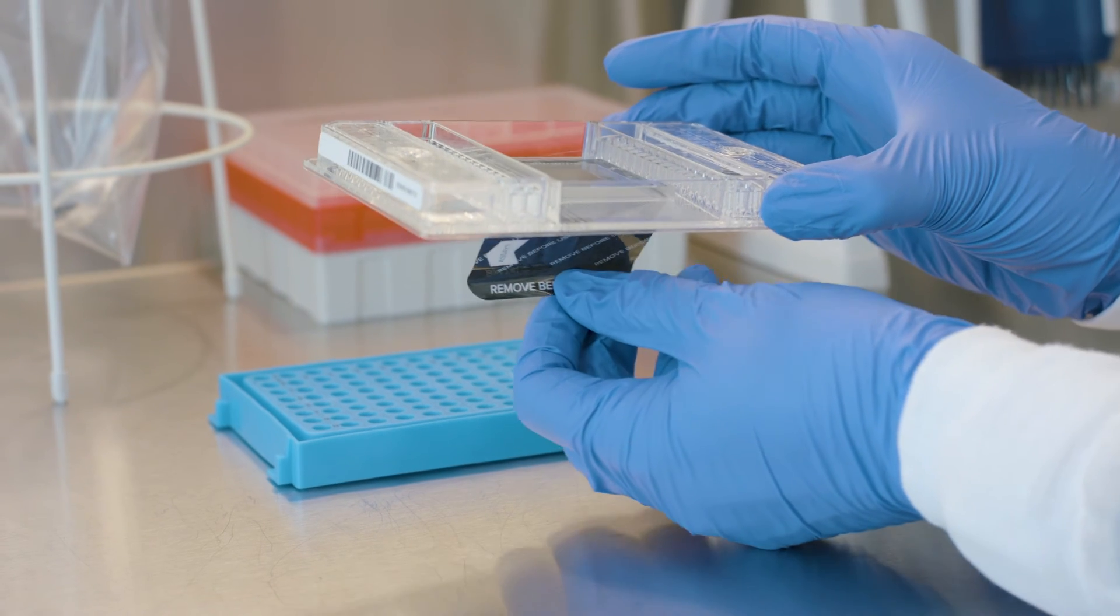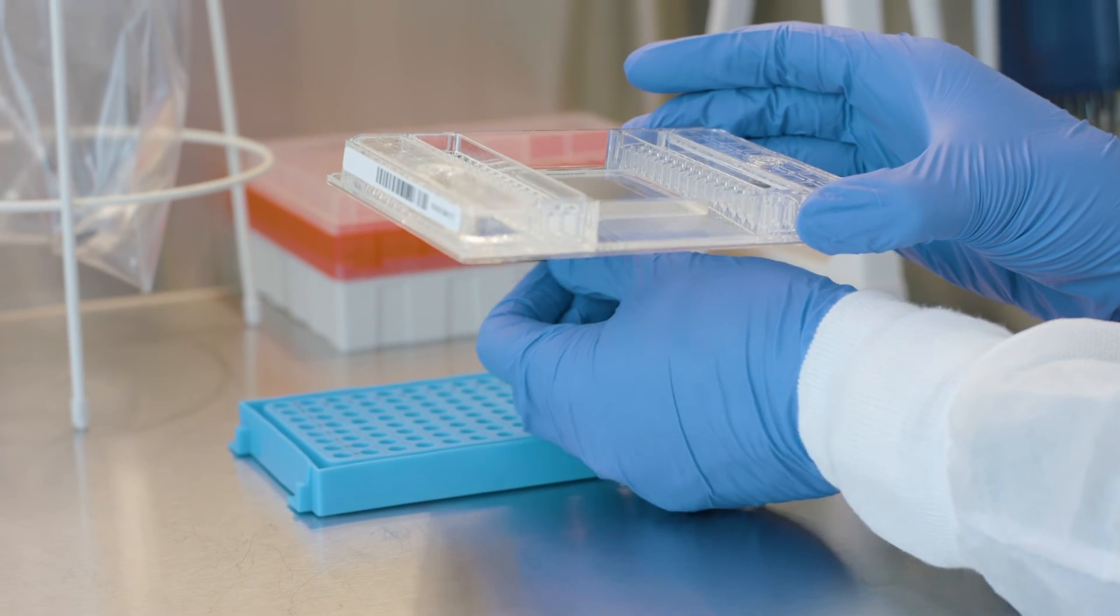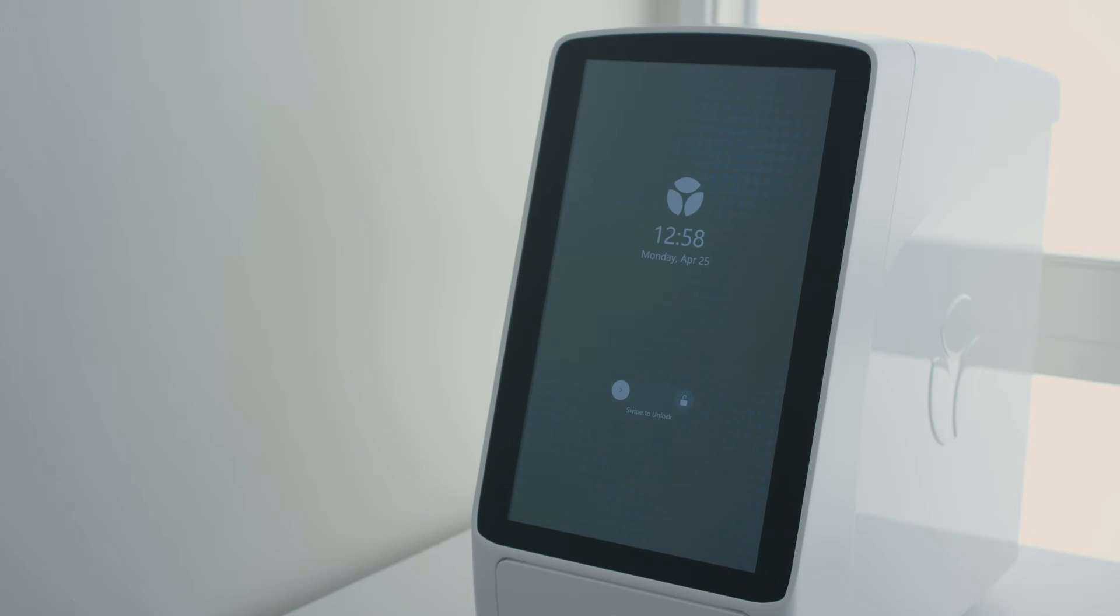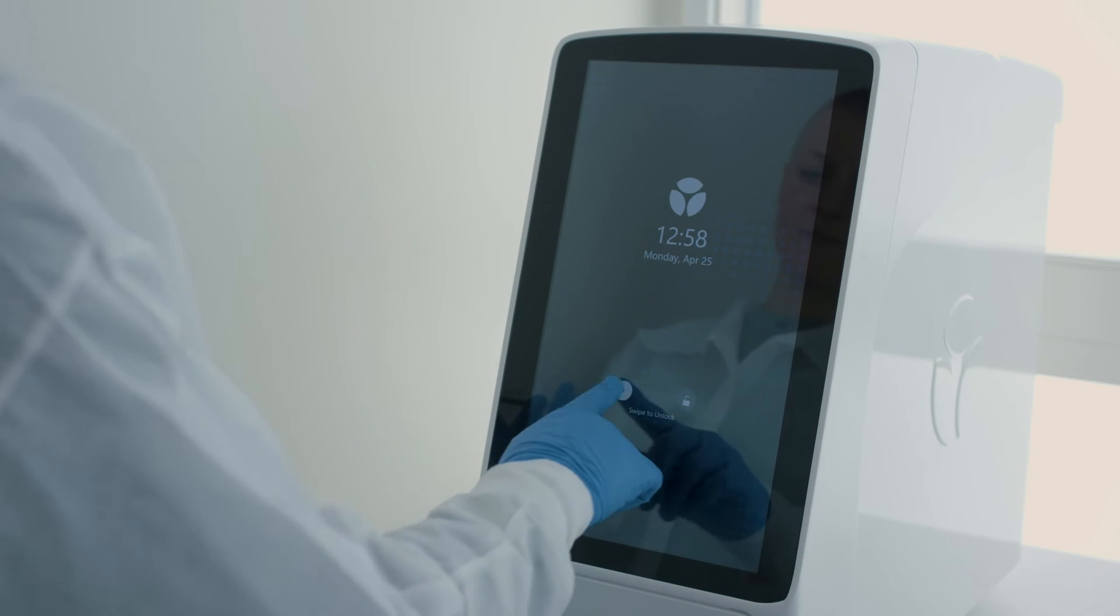Pull the protective film down and away from the bottom of the IFC and discard. Now it is time for the IFC preparation step in the signature instrument.